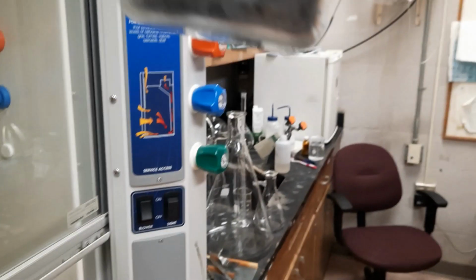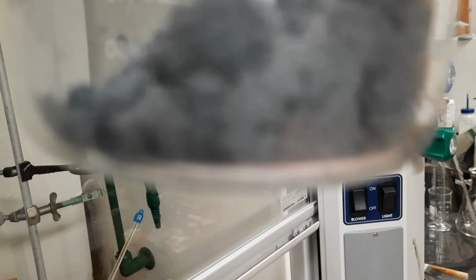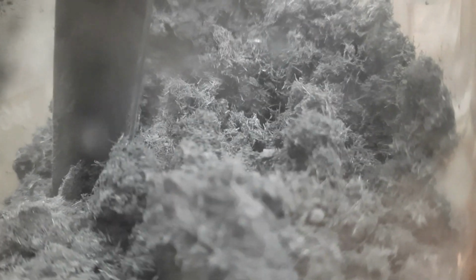Okay, let's start. So this is a mix of zinc and nitroguanidine. You can sort of see the crystals if it focuses. Focus. There you go. You can see the needle-like nitroguanidine crystals surrounded by zinc powder.